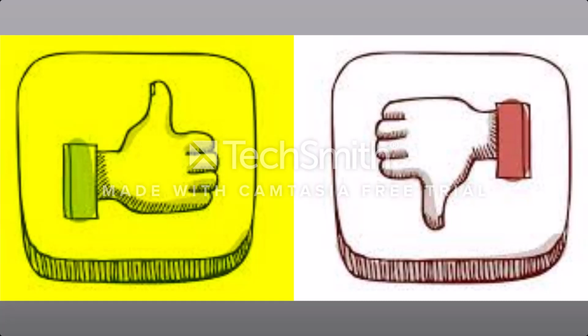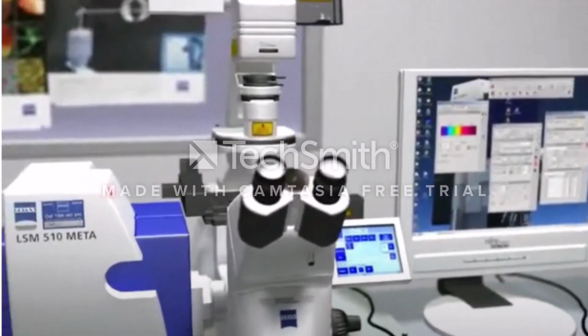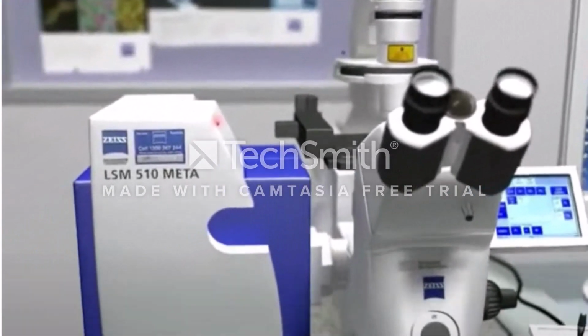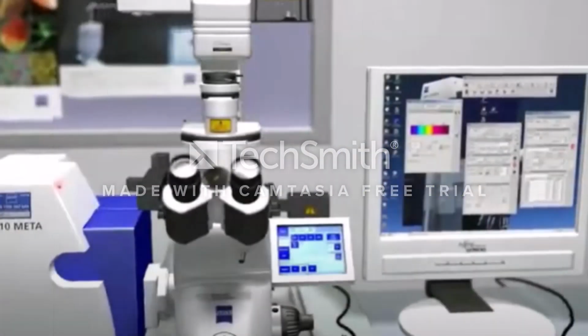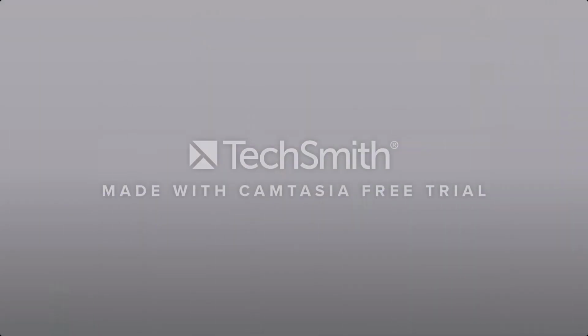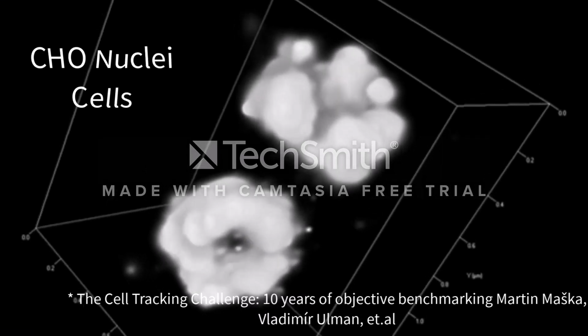HeLa cells are known to be robust and can contaminate other cell lines in the laboratory. This could be a disadvantage as it could lead to unreliable research results and complicate the experiments further. This is a typical setup of the equipment used in gathering this data. Here, we can see a microscope Zeiss LSM 510 Meta, having a planapochromat objective lens with a pixel size of 0.19 by 0.19 microns.